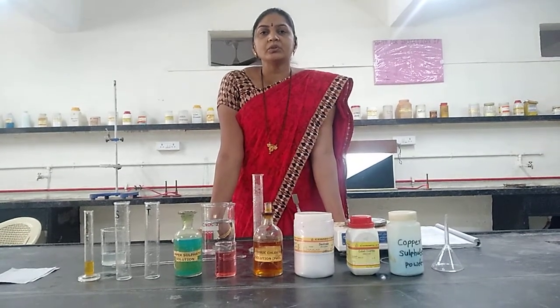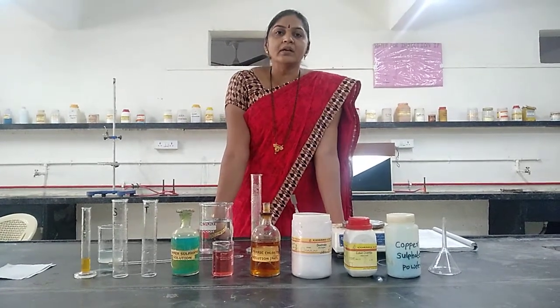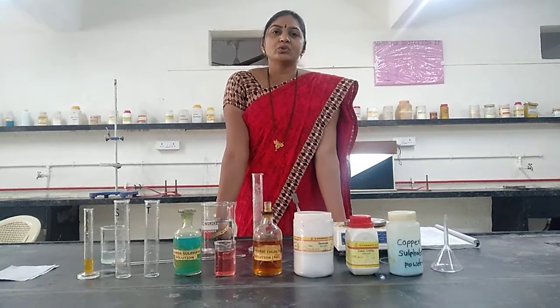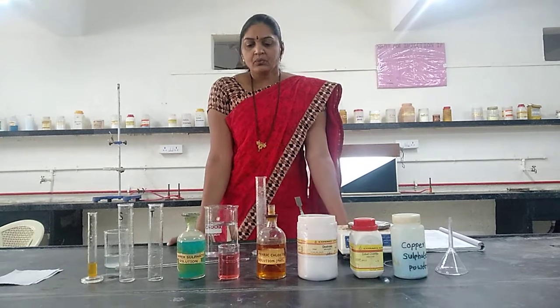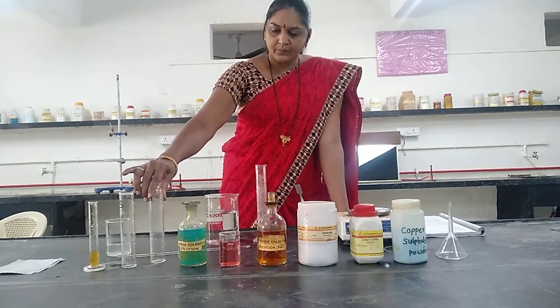One solution will be colorless and the second one, the standard, will have a somewhat brownish color. The difference shows whether it is suitable for the preparation of parenteral or not. So for performing this practical, we require two Nessler cylinders.